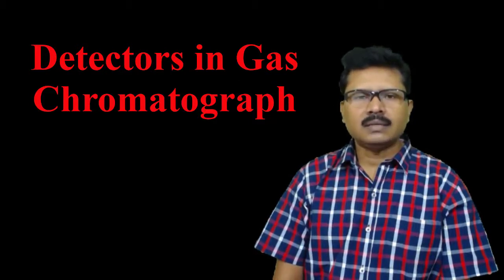Those components are then detected by different detectors. Now in this section, I will explain about different detectors. I am entering into the discussion.